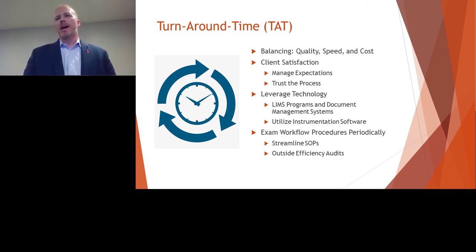They spend hours and hours doing peer review or looking line by line, when an instrument and the computer program can do it in a matter of seconds or minutes. So it's really important to look at the technology and the software that you have, the availability of them, and their capabilities so that you are utilizing them to your advantage.